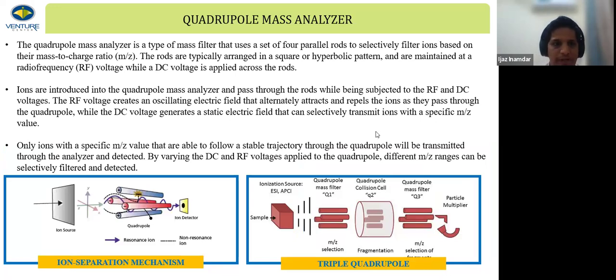Quadrupole is also a type of gold standard in mass spectrometry. If you see a very established laboratory that is doing highly regulated work, till now at least, they are using quadrupole for their quantitative work. With the quadrupole, the intuition is again very easy to understand. What they do is they generate a field between these two quadrupoles.